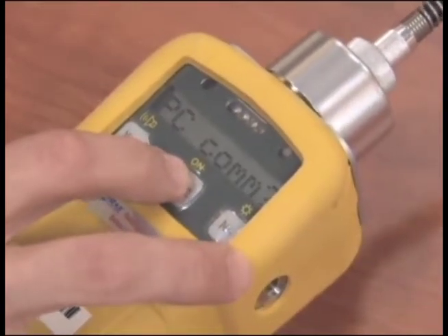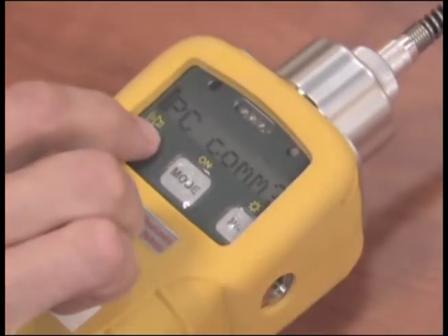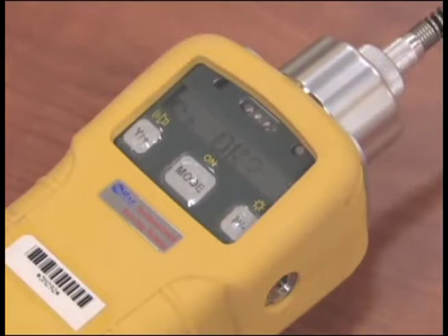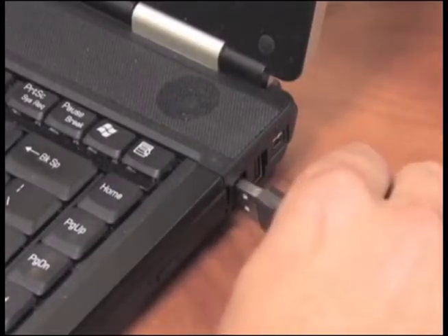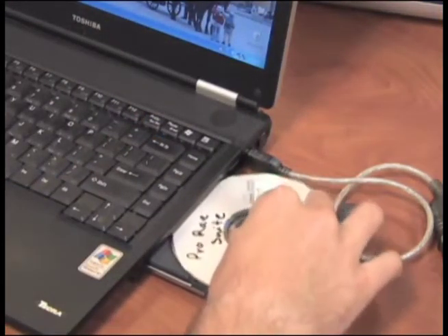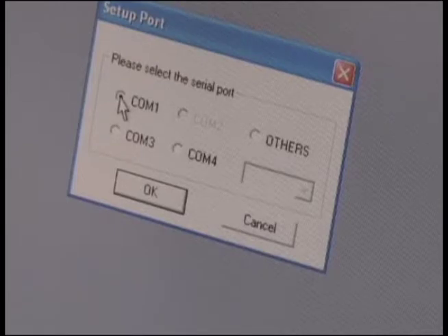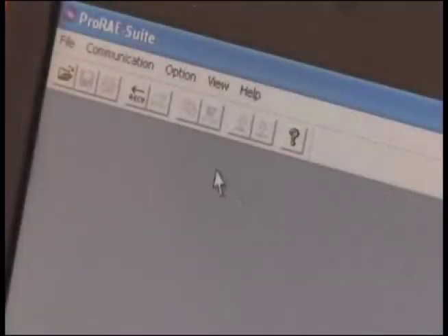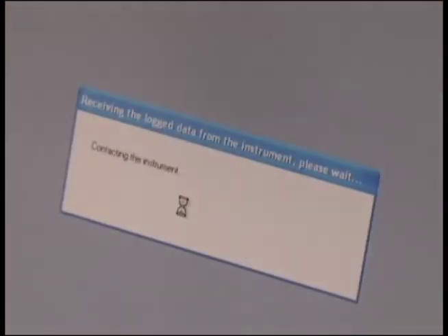To do this yourself, press the Mode button several times until PCCOM? appears on the screen. Push Y and Pause Monitor? will appear. Push Y again. Attach the data transfer cable to the bottom of the unit and to the COM port on the PC, with or without the USB converter cable. Load the software CD and follow the online instructions. Open the Communications tab under the Toolbar, Setup Port and select COM Port. Press the RECV icon with an arrow pointing to the left under the Communication tab in the Toolbar. Click OK and data will start to be downloaded.